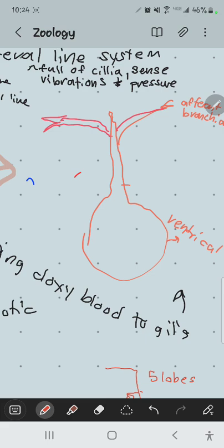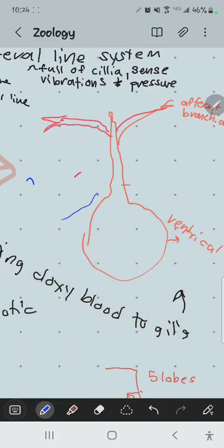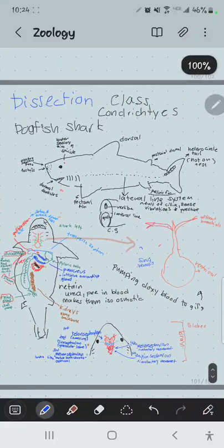Sound good? Okay, I know we're pushing time here. You know, that's the way it goes. What I'm going to do here is show you how this goes. I'll get gloves on. And we have these large platter boards here, these kind of cookie sheets. So what you're going to do is grab a cookie sheet for each table, bring it back here.